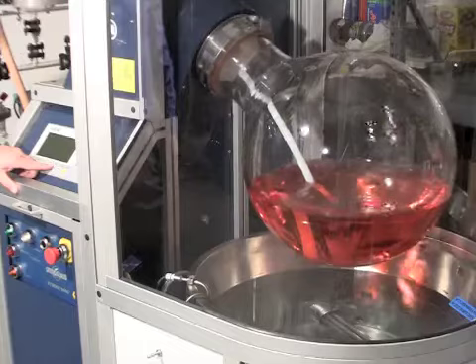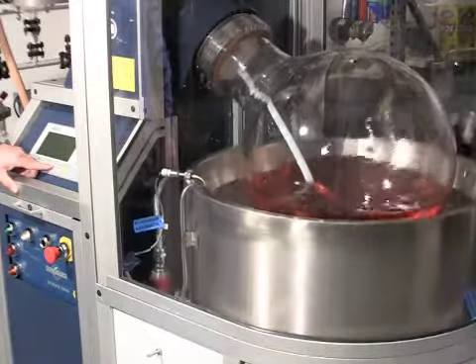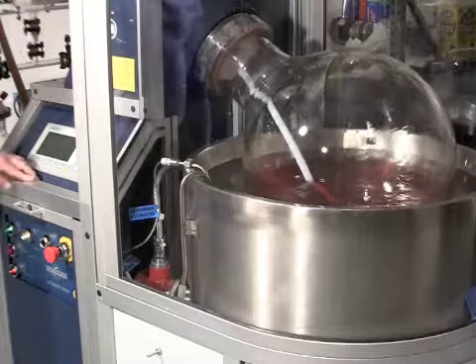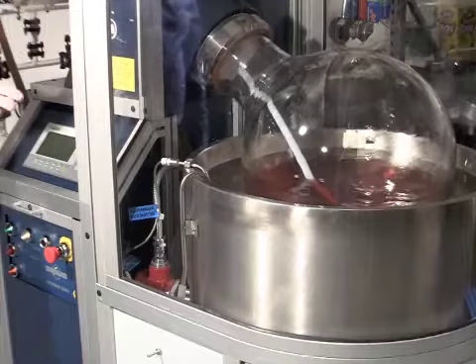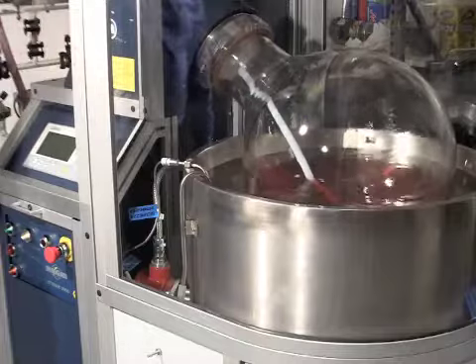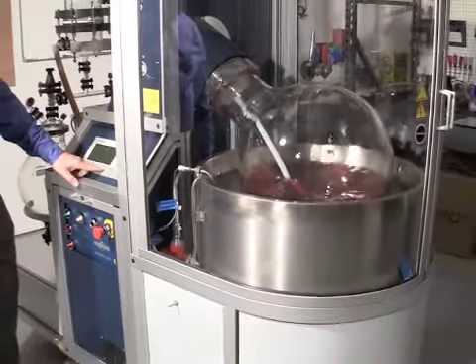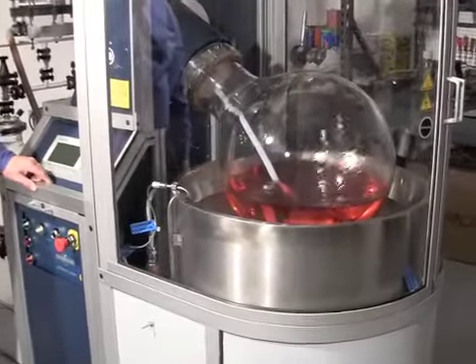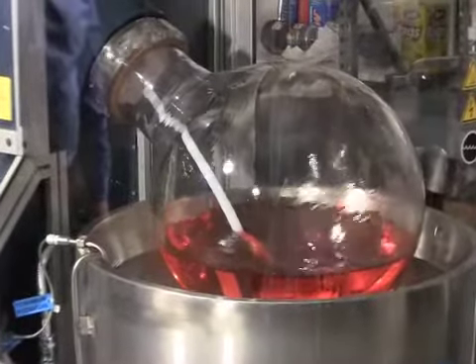By pushing F4 we raise the heating bath, which is raised hydraulically, and now we're applying heat to the vessel. We are offering a gentle method of heating — with vacuum applied we reduce the boiling temperature and allow the solvents to start evaporating off. We can also move the vessel down wherever we like and stop it along the way, which is another way to control how much heat we're putting into the evaporation vessel.